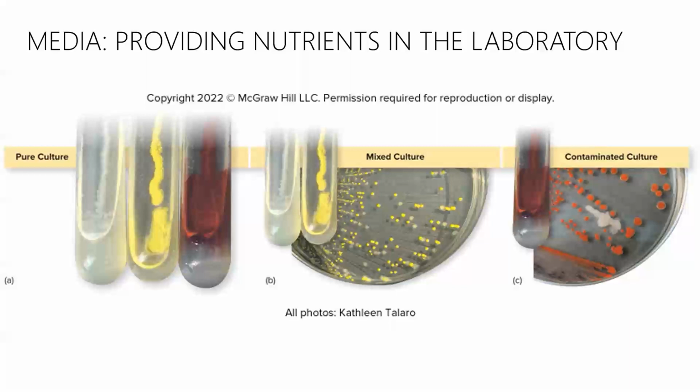A pure culture is when we have one type of microbe growing on the plate, or we can isolate it and get only the Staphylococcus aureus or only the E. coli and separate the two. You cannot do this in broth because I cannot see the microbes. They may be floating around in it, but I can't pick them out as they float by. To do this, I have to use a solid media where I can see the individual colonies.